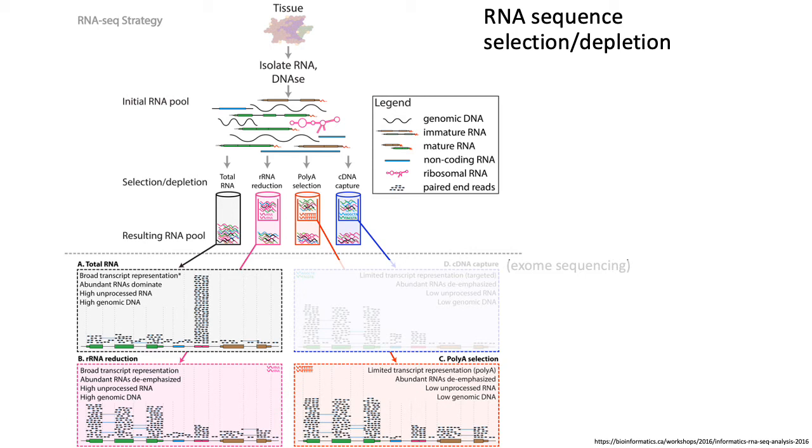And so what will happen is that the poly-A-tails will anneal, they will hybridize to the poly-T tails hanging off of these beads, and you can essentially select out these poly-A-tailed mRNA, and then only sequence those poly-A-tailed mRNA. And in doing so, you're essentially selecting just for that one species of RNA, and getting rid of both your ribosomal RNA as well as your non-coding RNA that are not poly-A-tailed, as well as most of the other non-coding RNA.